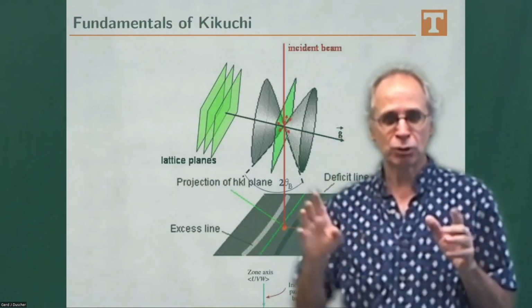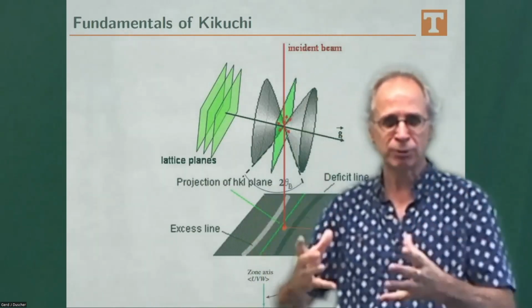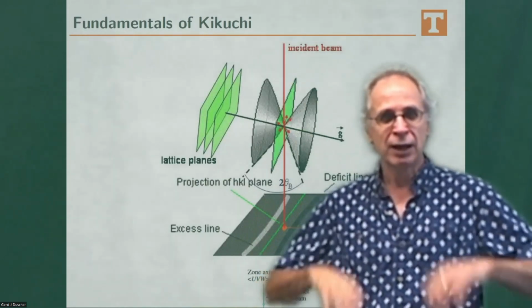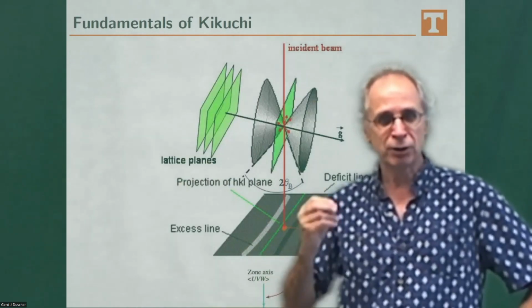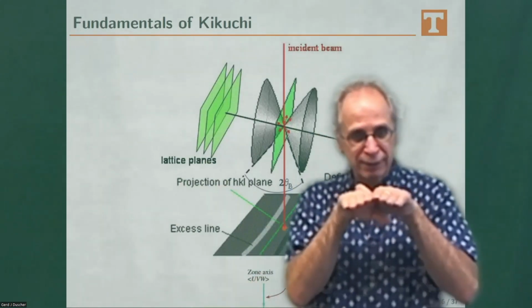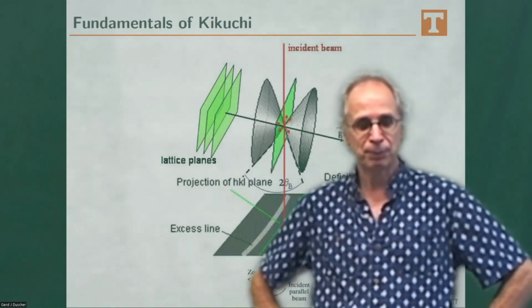In the very first orders they have slight forward directionality, but we forget about that. For a Gedanken experiment, say they all go in all directions homogeneously. So part of these electrons move anywhere they want to, and what you would get is, of course, a homogeneous gray background.